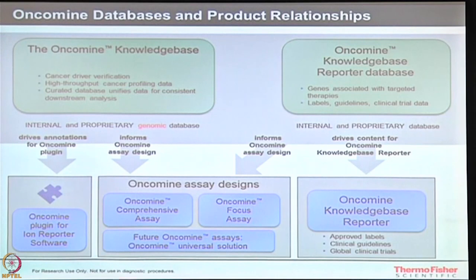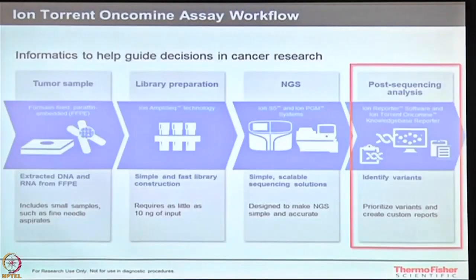You have certain assays available which can be utilized to detect the variants coming into your samples. And the same samples are utilized to denote whether the variant that has been detected has any clinical significance or not, and with the clinical significance, whether it is correlated to any drugs or not. Okay, so this is something that you have as a summary.